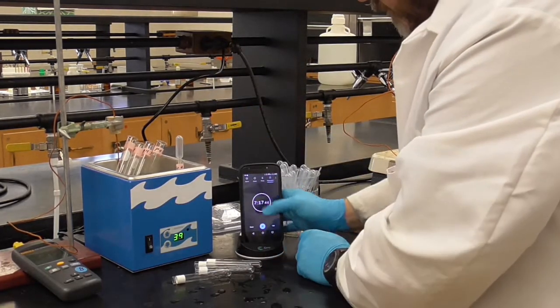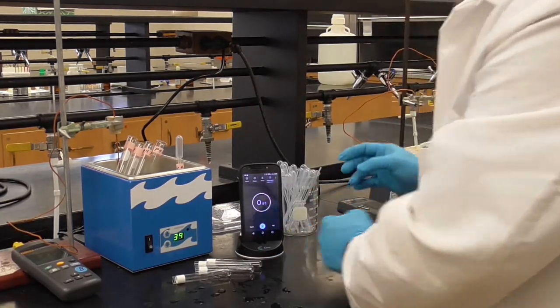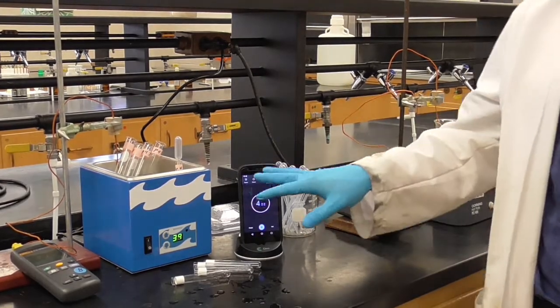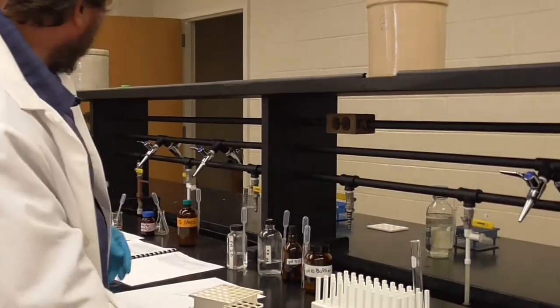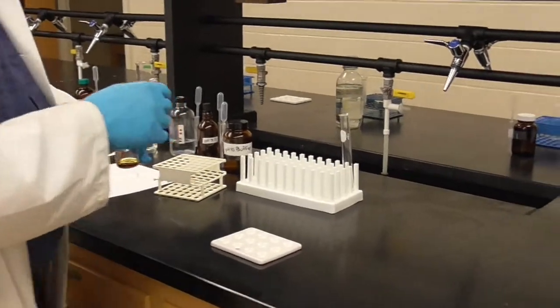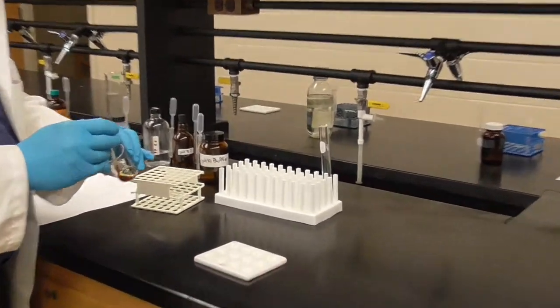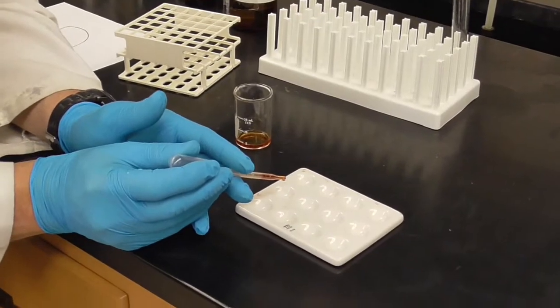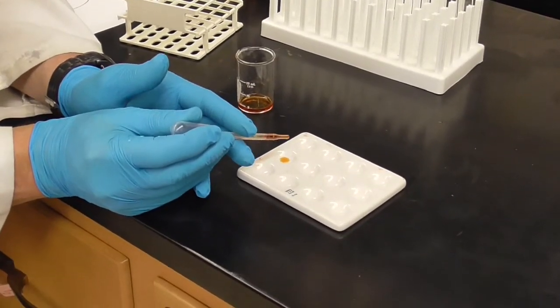Let's go ahead and start our timer off. First, the protocol says to give them 15 minutes to react. While that starts, let's go over here and just quickly prepare our test plate as usual. We've got our indicator solution of iodine, and we have 4 different solutions that we'll have to test. So we just need to drop in our 4 different wells. So drop in each one.